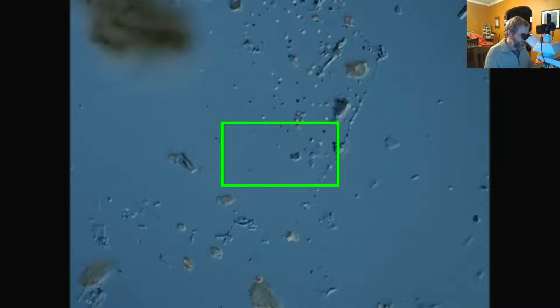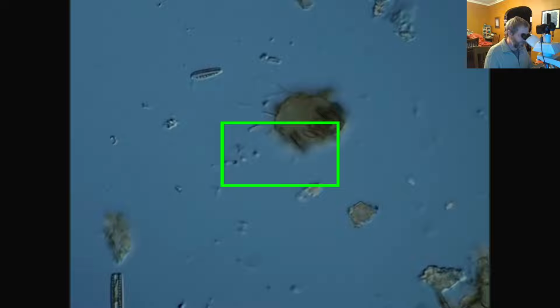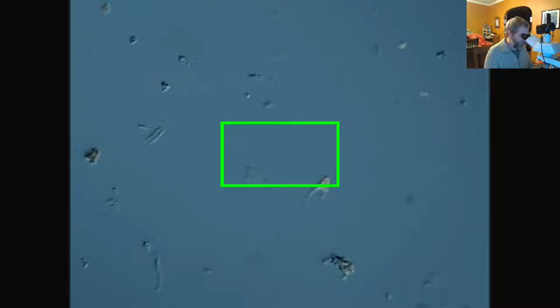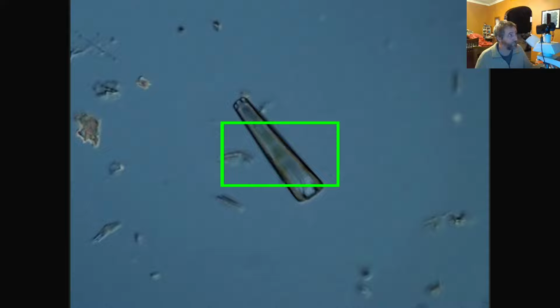Pretty cool story with those. The structures are only meaningful if you have an SEM and you happen to be a nerdy diatomist. They're just little pores that go through the diatom that are shaped in a really weird way. They look like several structures that are kind of fused together, and a little confusing as a result.